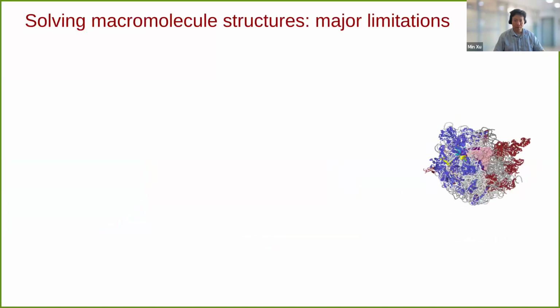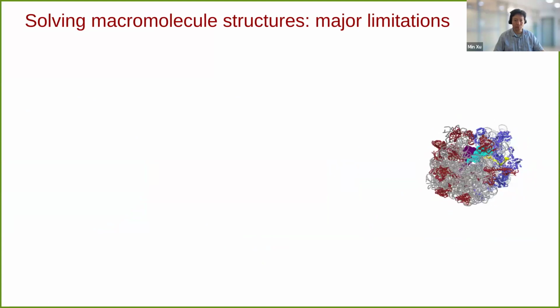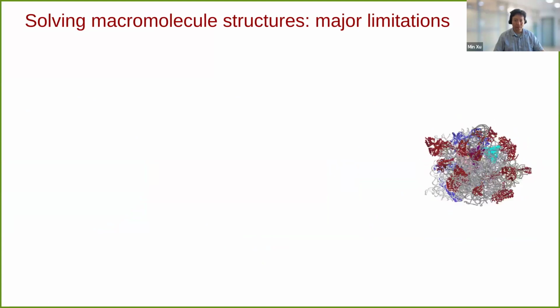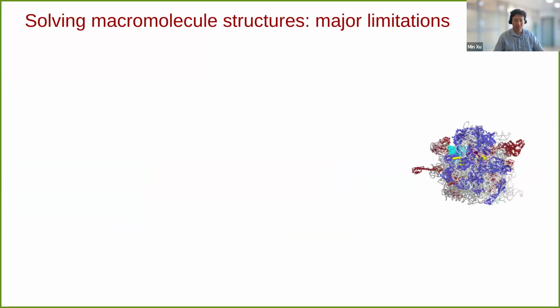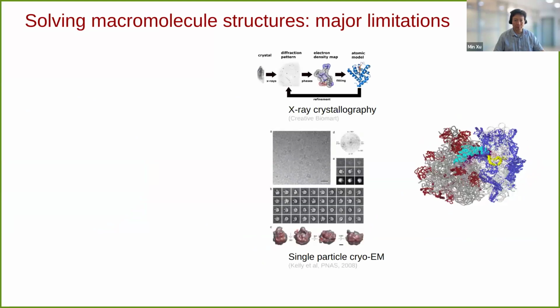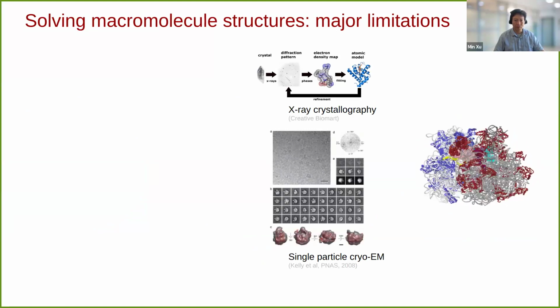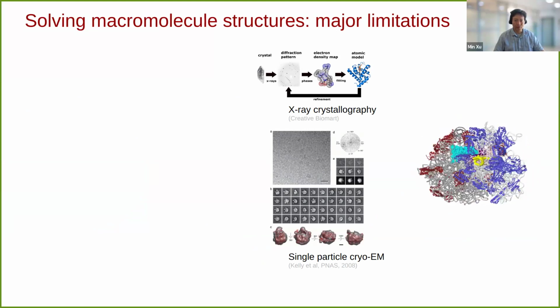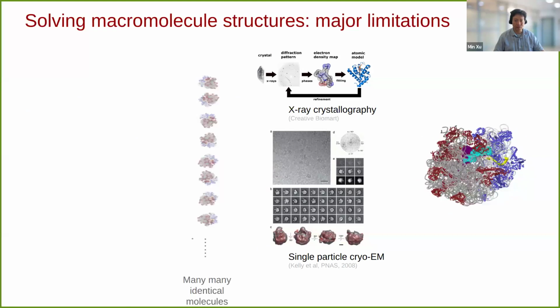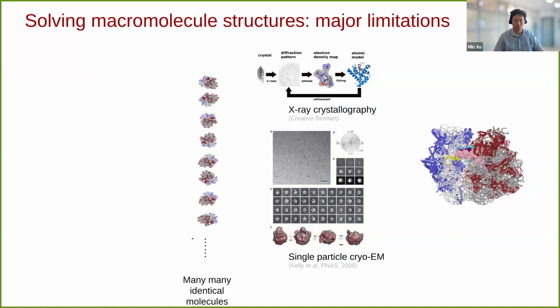Currently, although we can get beautiful high-resolution structures of certain macromolecular complexes, there are major limits in the way we obtain such structures. These structures are obtained using techniques like X-ray crystallography or single particle electron microscopy. The input of such techniques uses many macromolecules with identical structures.